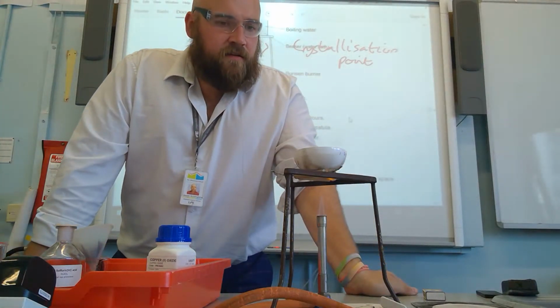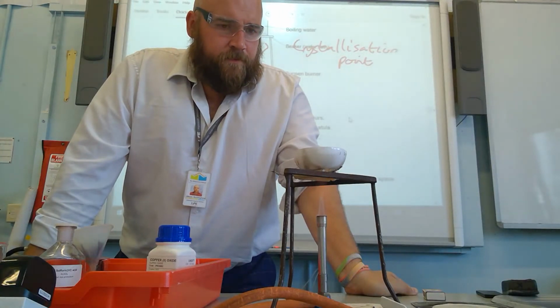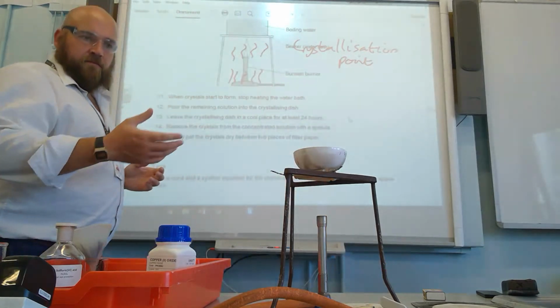Is that a nice steady boil, would you say? Yeah. So I'm just going to keep heating that. Let's evaporate most of it.